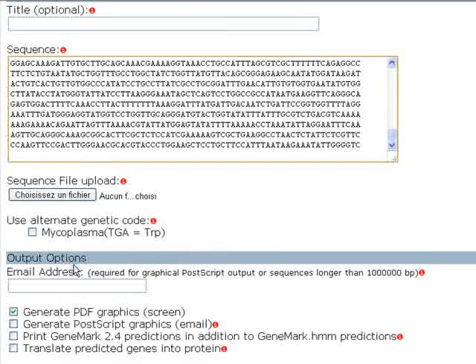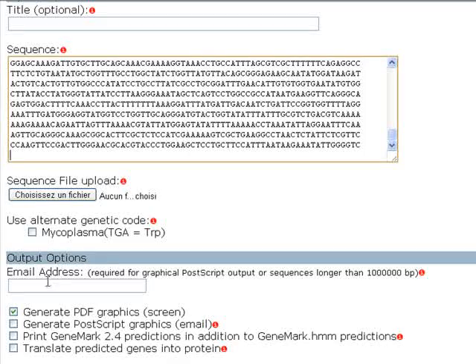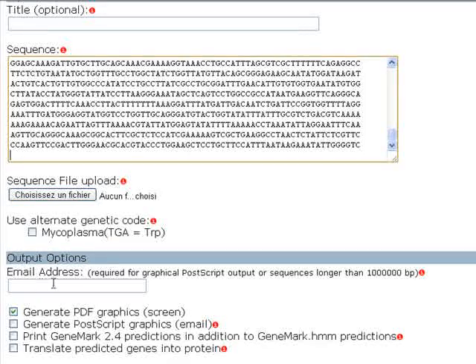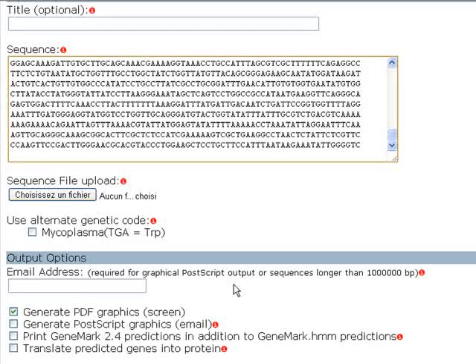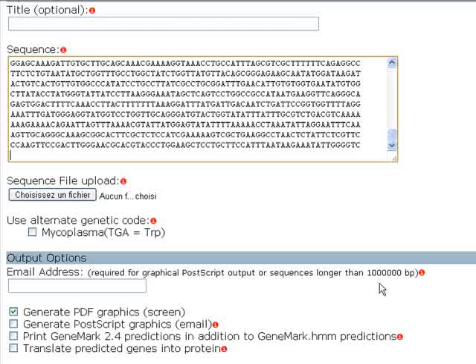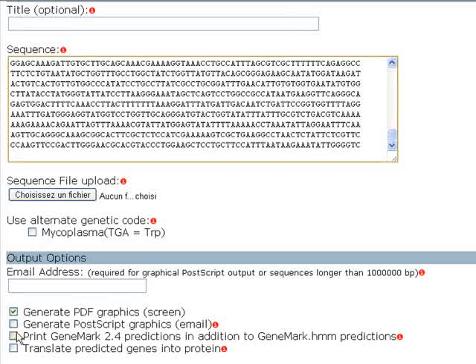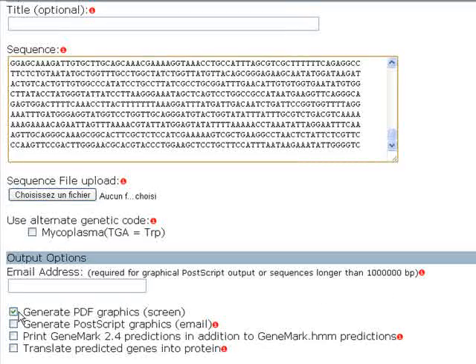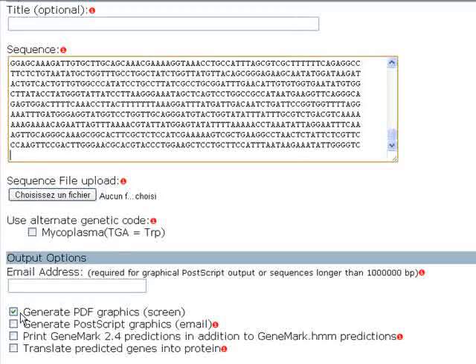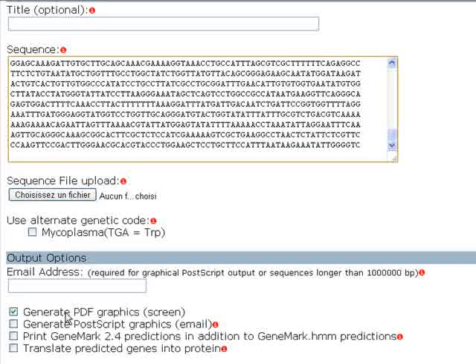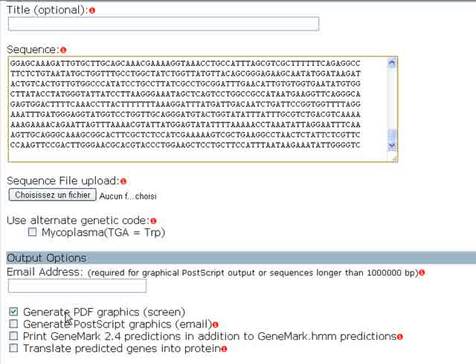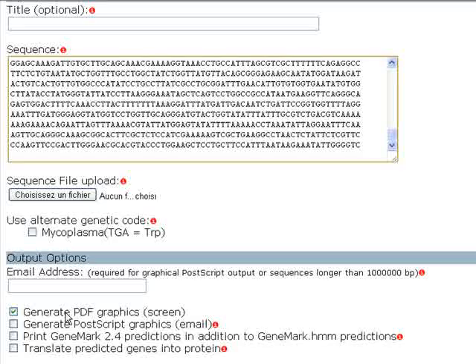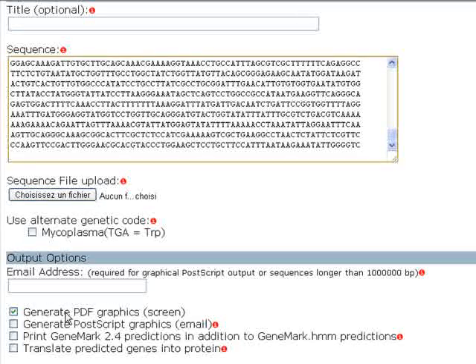From the output options section we can enter our email address here. They say that it's only required for graphical postscript outputs or sequences longer than one million base pairs. From these four options, if we select the first option we can generate a PDF graphics file that I find very helpful and useful.